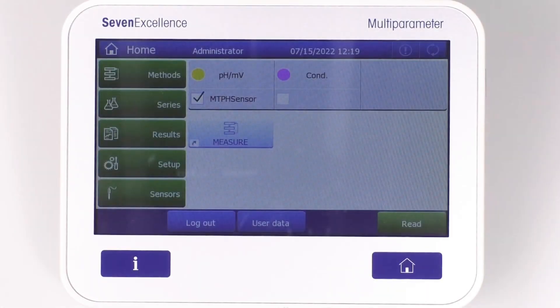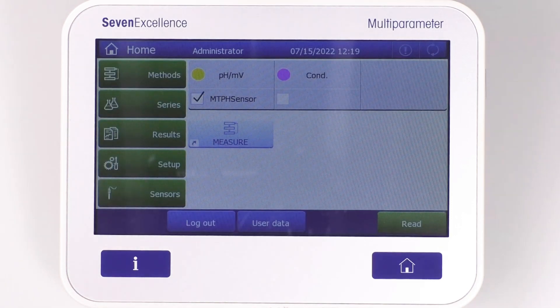ISM in 7-Excellence pH meters can quickly and accurately identify the type of sensor connected to it, eliminating the need for manual calibration or input of sensor parameters. 7-Excellence makes it simple with ISM sensors, whereas for non-ISM sensors, creating and assigning sensors to modules is necessary. So let's dive in and learn how to do it.